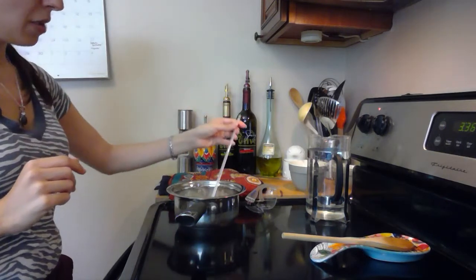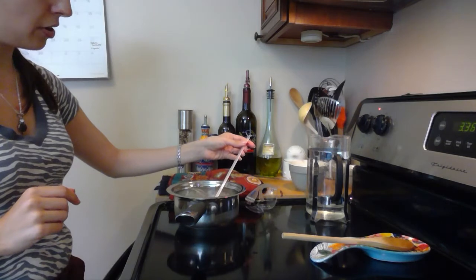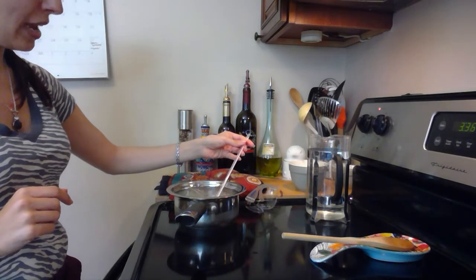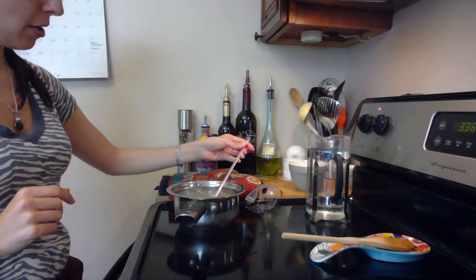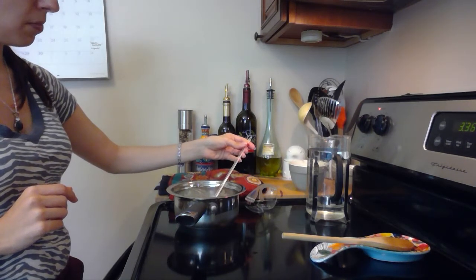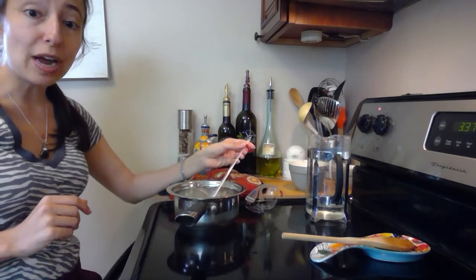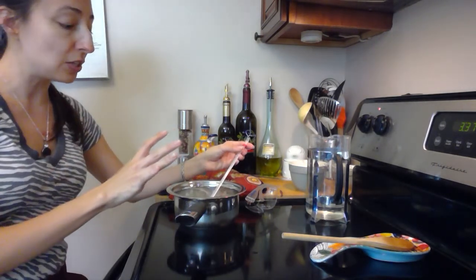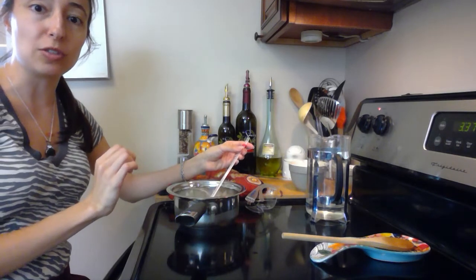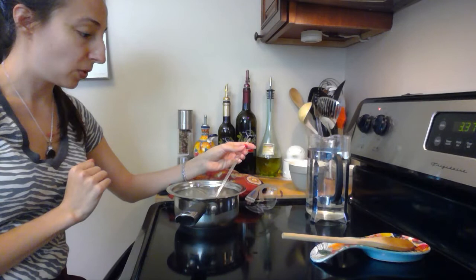And now I'm going to take my thermometer, make sure that you place the colored tip in the water ice mixture, and you wait maybe about 30 seconds at least until you see your line stop moving. This temperature that you're going to record is actually for time 0. So we have not turned on the heat source, we have not started the experiment. This is just our initial measurement, how it is before we start to heat.